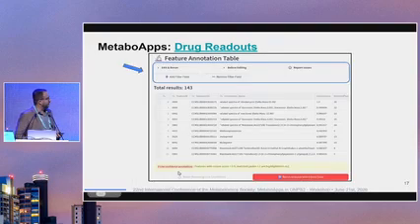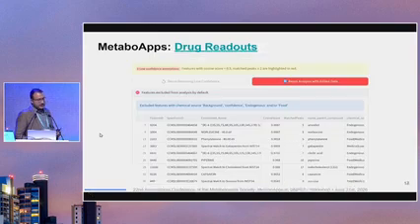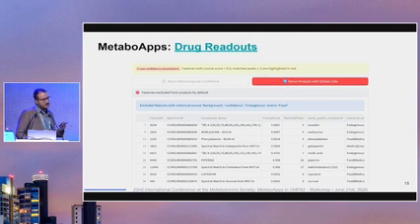that you see at the bottom here this warning, and I'm going to highlight that. For example, in this example data set, you're going to have 0 low confidence annotations. All the annotations, as an example, we already know are high in confidence. Based on that, we have the parameters for the cosine score. For this data set, as I said, as an example, all the cosine scores of the MS spectra are higher than 0.9, so we have a 90% match.